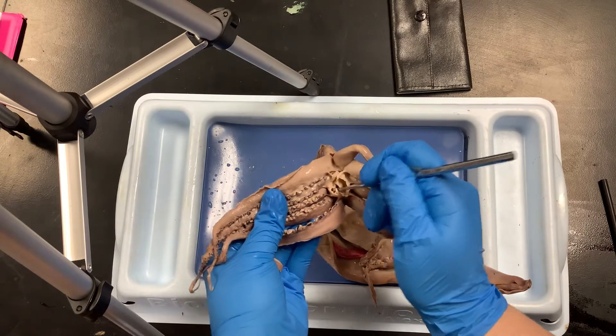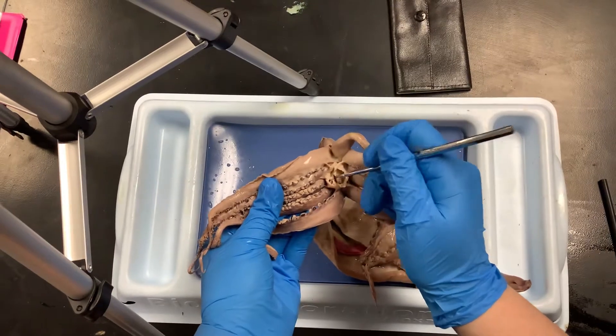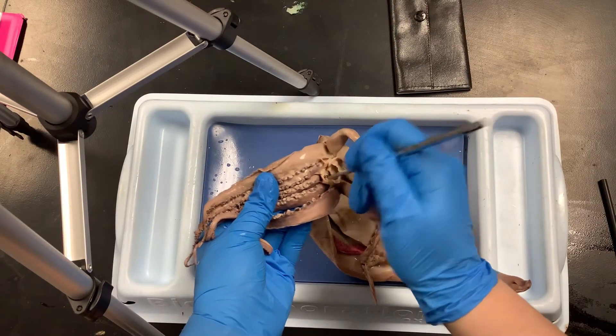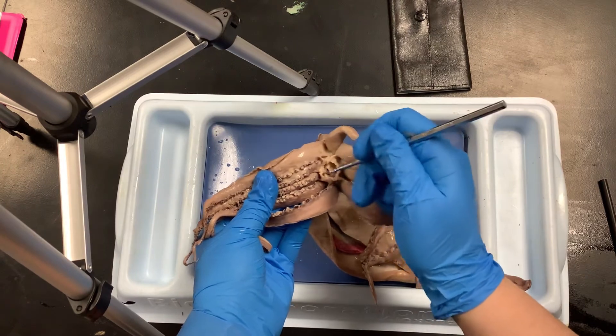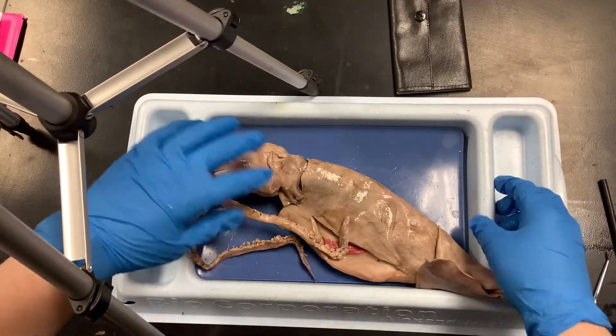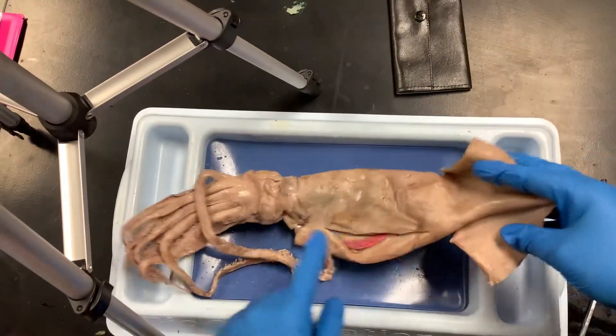You should also be able to stick your probe in there and feel something hard — that's the beak, which we will expose a little bit later. You can actually hear it clicking.